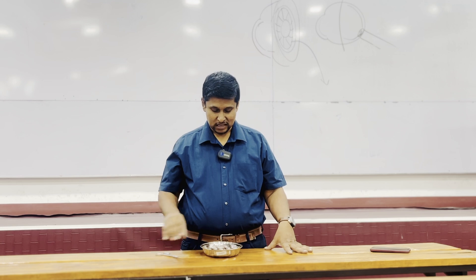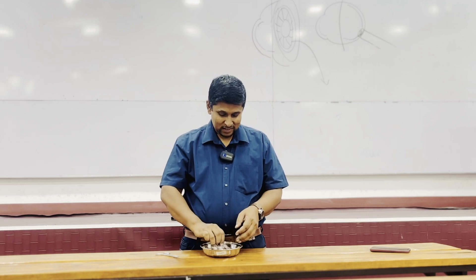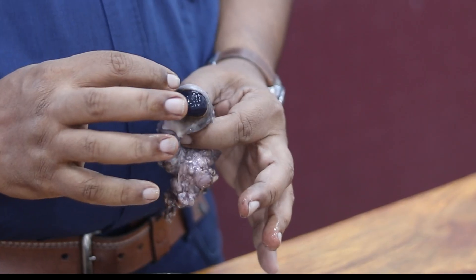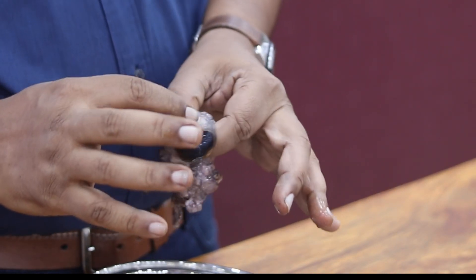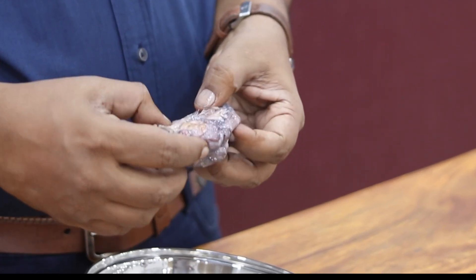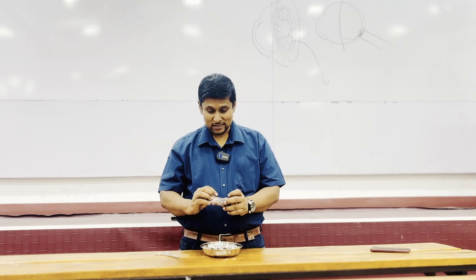Hi everyone, we dissected the bovine eye today in class, so I thought of showing it to you all. It's a little dry at the moment. This is the bovine cow eye. This is the front side — we have the cornea, and the white color part is the sclera. At the back we can see the extraocular muscles, what you call extrinsic muscles.